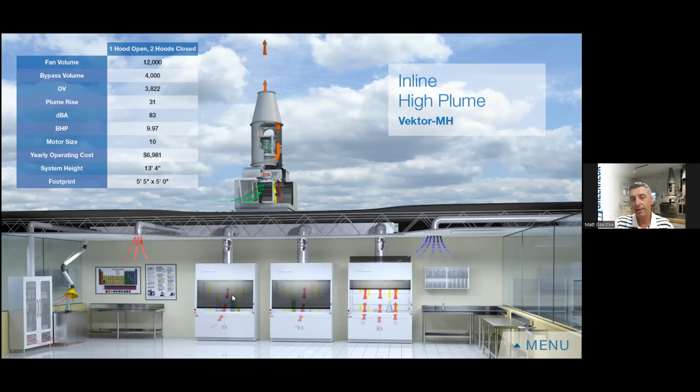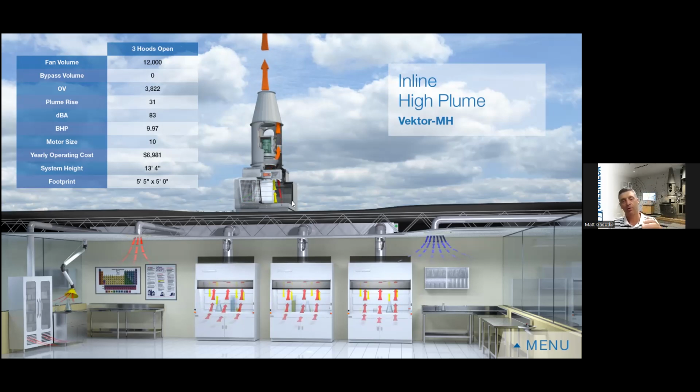To deal with that in a traditional variable volume system, what we do is introduce bypass air that comes in from outside adjacent to the fan to make up for what's not coming in from the lab space. And that bypass air comes through what's called a bypass damper, and it's in a bypass plenum. That bypass plenum assembly is a critical component because it allows us to mix in outside air with the laboratory air to make sure that this light stays green as much as possible.